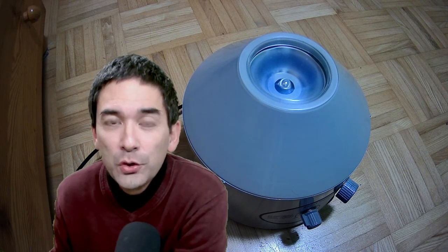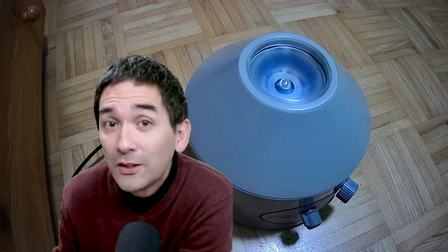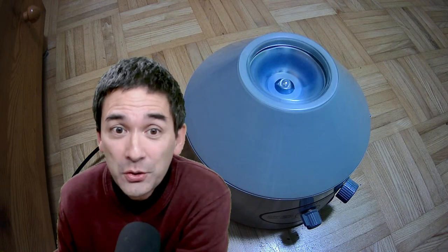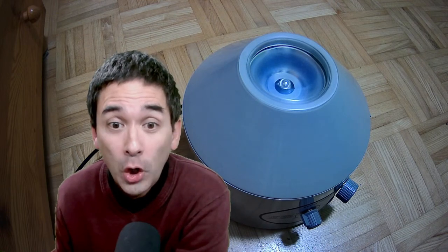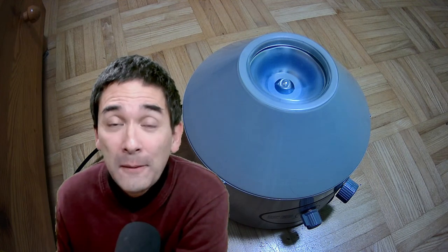The centrifuge was around 60 euros or 60 dollars new on eBay — one of the cheapest I could get. It does its job. Centrifuges otherwise can be quite expensive, but this one is fine for me.